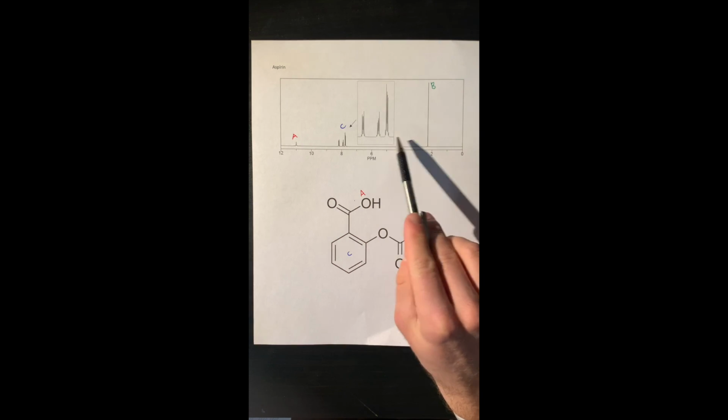So this singlet, this peak is a singlet because there's no hydrogens bonded to the adjacent atom, which is right here. There's no hydrogens attached to this carbon, so there's nothing for it to pair with, and it's bonded to an ester. It's part of an ester, so that's why it's a little bit more downfield, because a typical alkane would be less than 2. It would be closer to 1 ppm, but due to the placement of these hydrogens, the signal is slightly further downfield. So now looking at the remaining 3 peaks around 8 ppm here, it's blown up here, so it's a little bit easier to see.